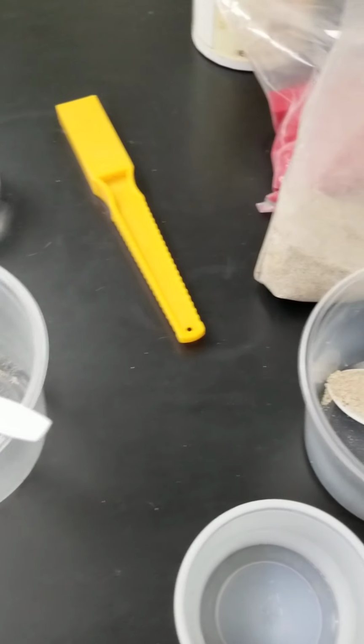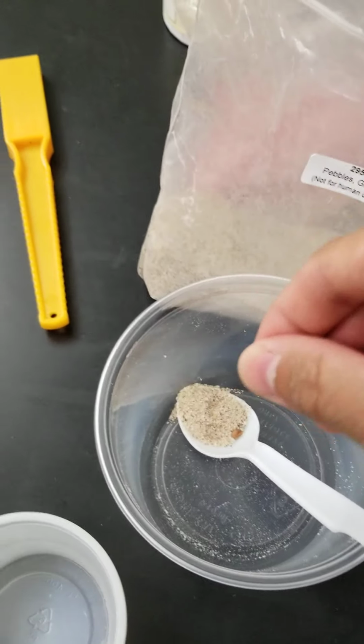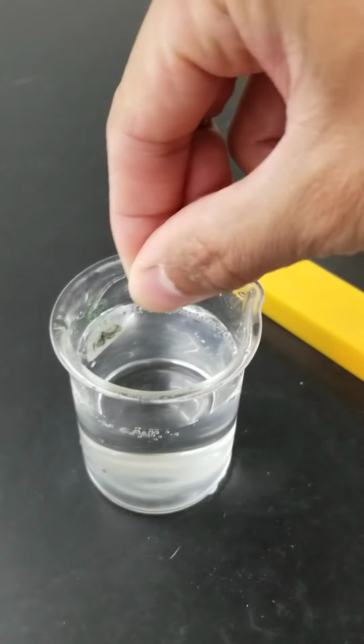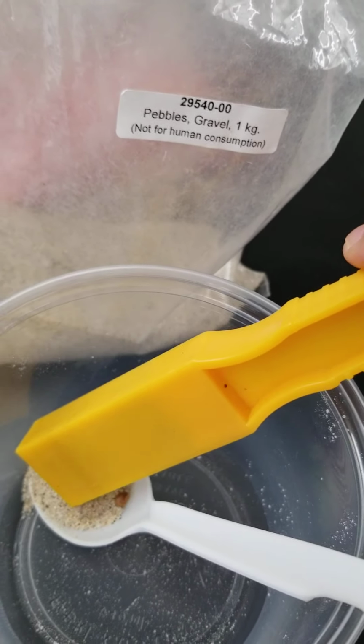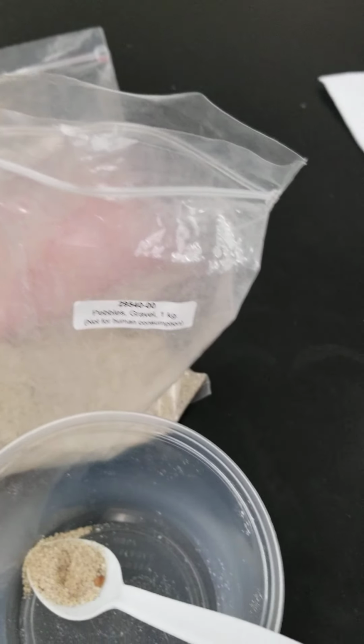Now we have our second one. This is sand, so I'm going to pick up a small amount and dump it in our water. So there it is. Let's do a magnetic test. There's a little bit of specks of sand in there. Let me clean that up.